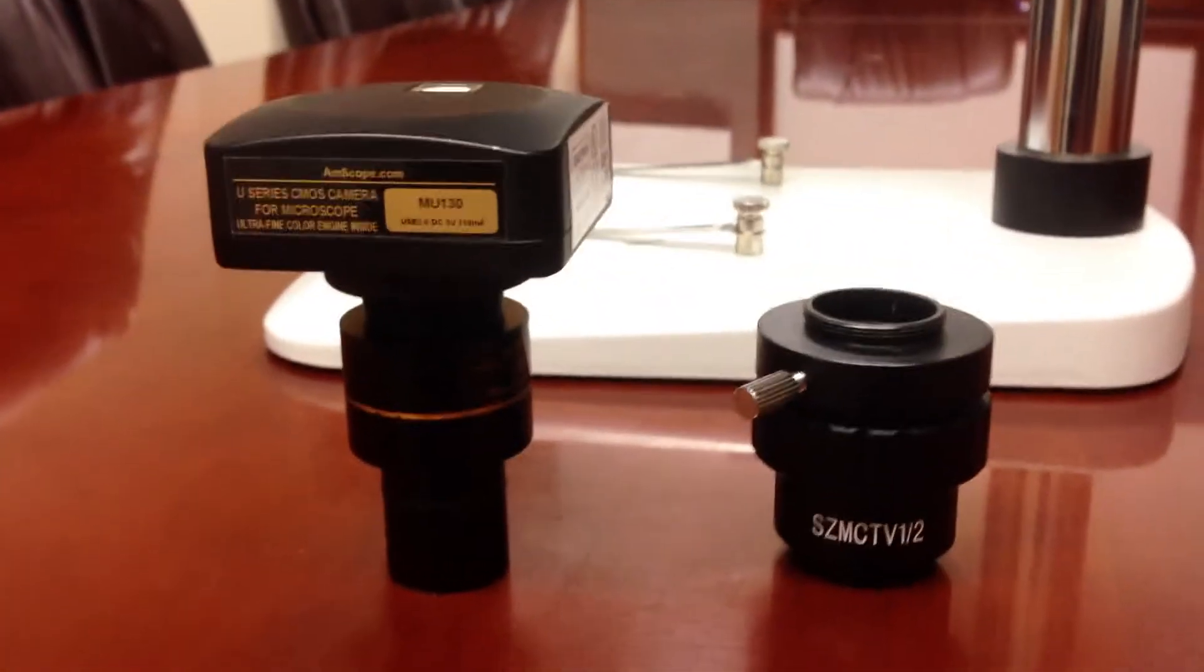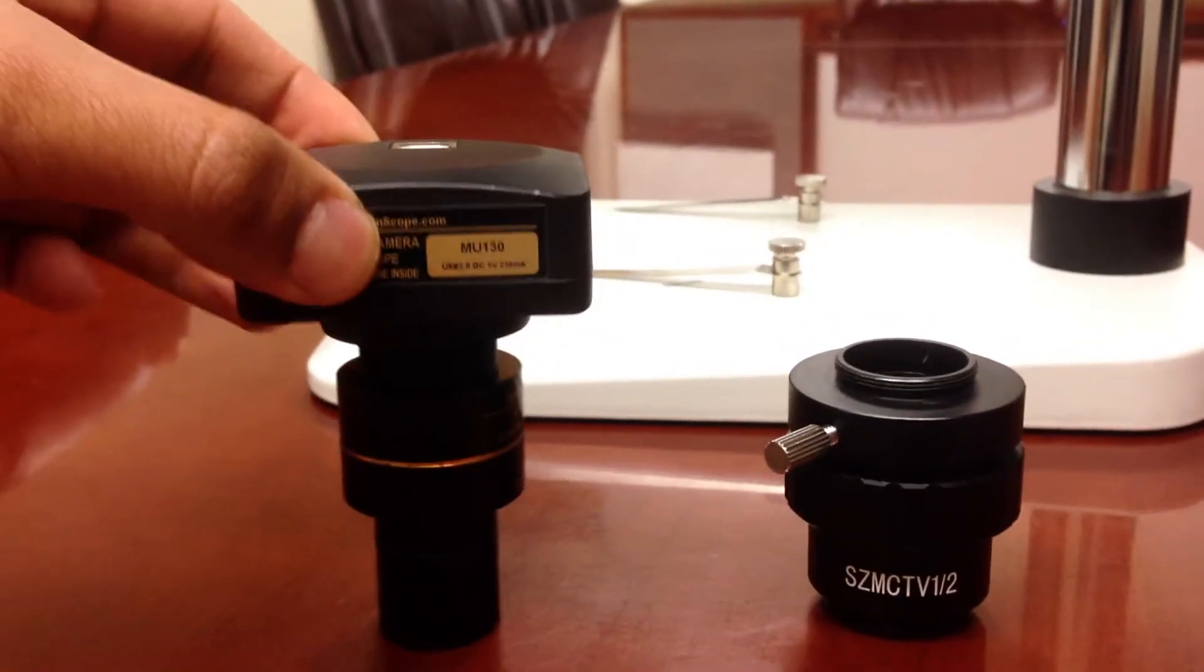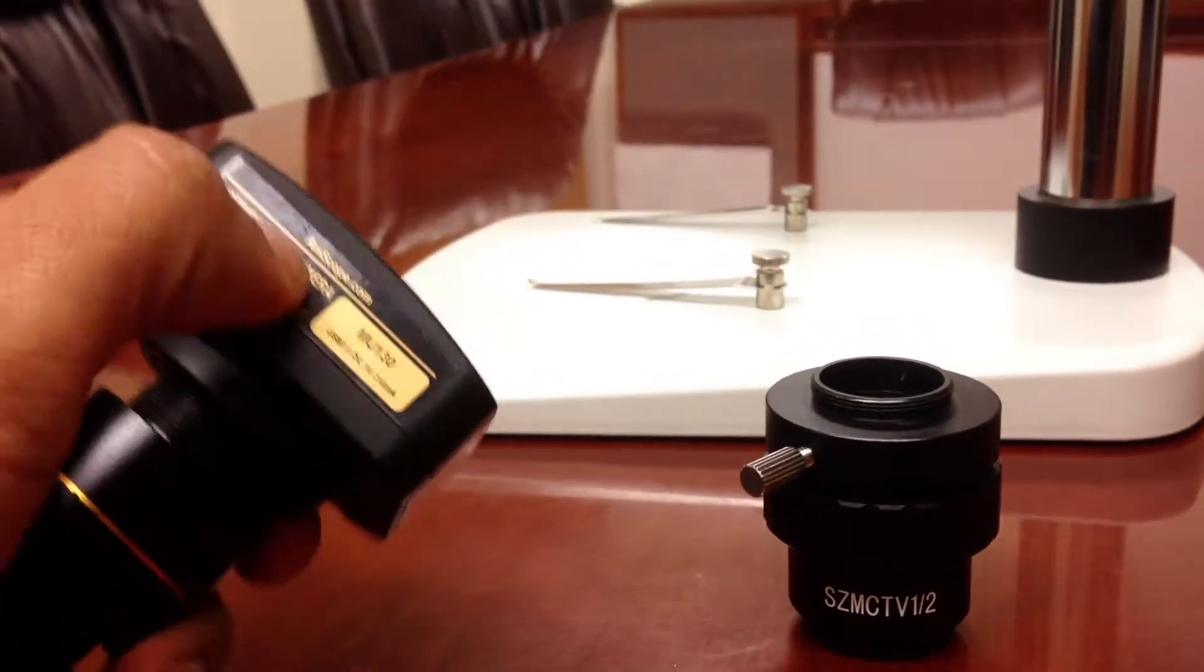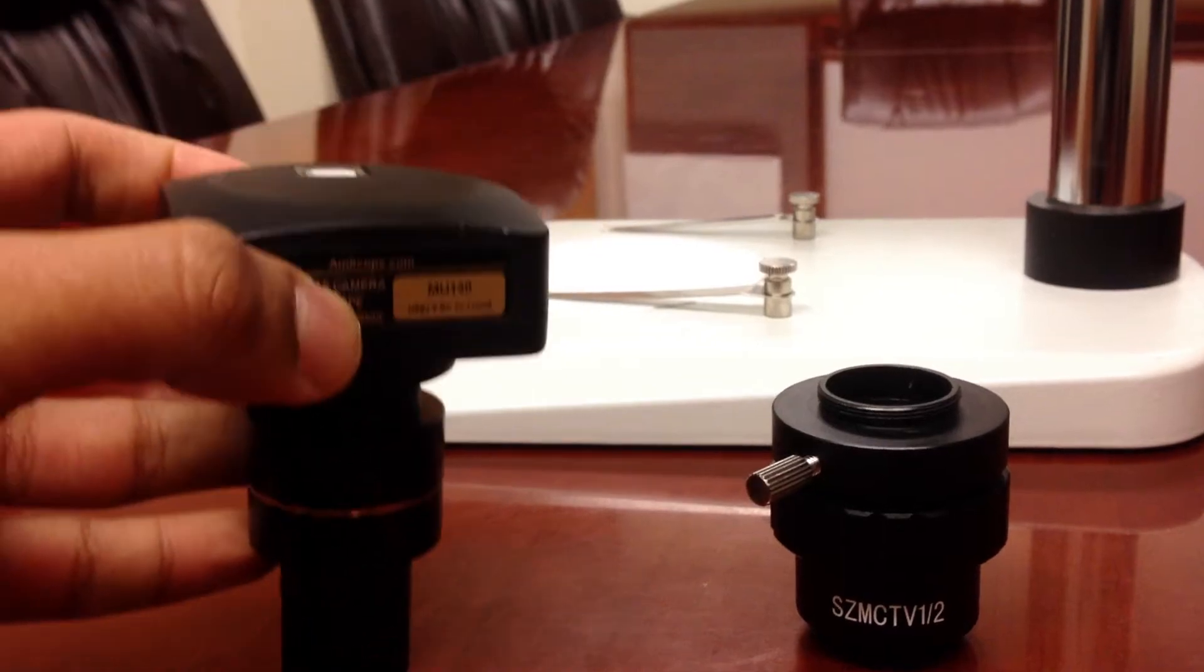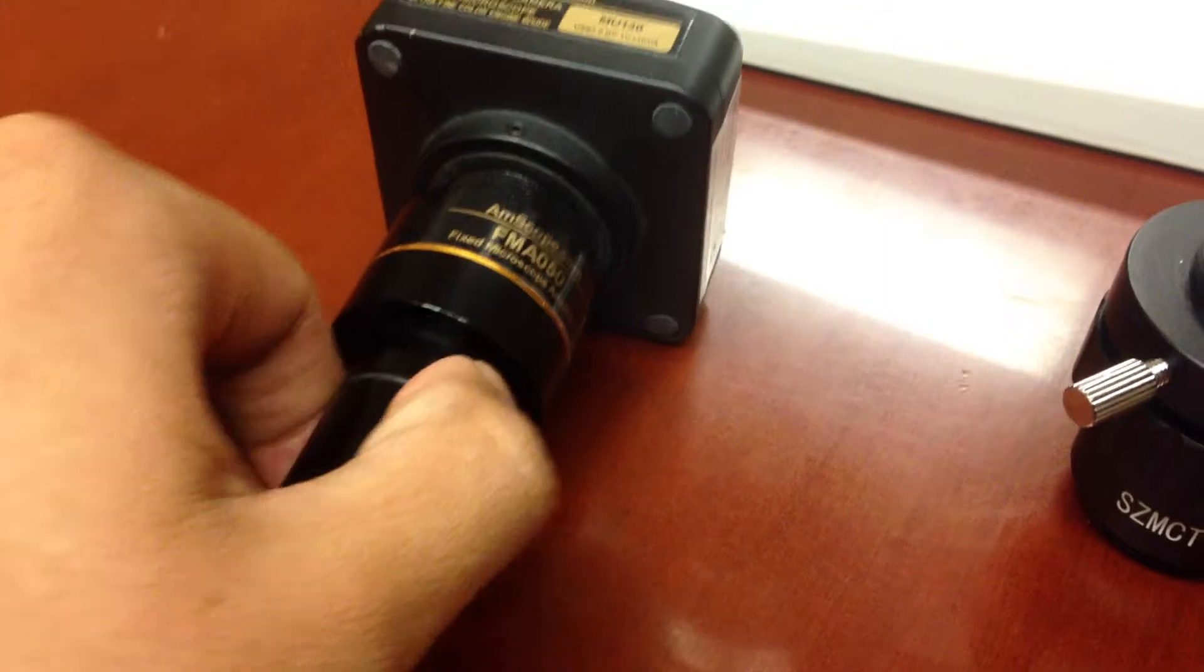So your MU, MA, or MT series camera will come with two parts. The first part, the top part, this is the camera part that has the sensor. And the long tube that's attached to it, this is called the reduction lens.